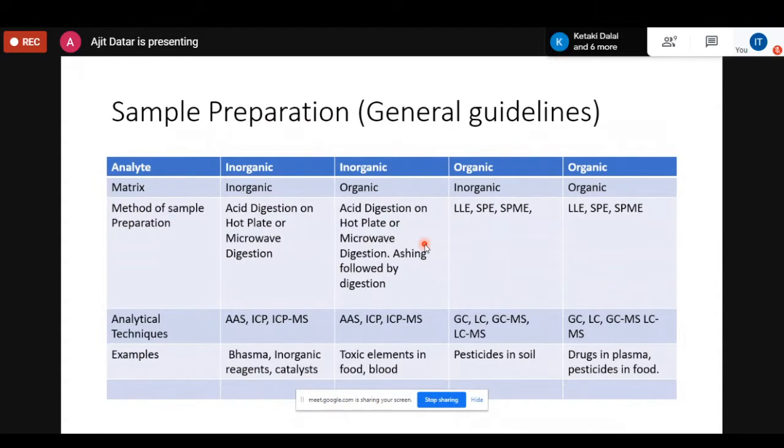Okay, so there is a microwave oven like what we have in a domestic microwave oven, but more specific for laboratory purposes, in which we can do acid digestion. It could be closed vessel or open vessel digestion. Generally, we prefer closed vessel digestion because many times we could have volatile elements like arsenic, mercury. These elements being volatile, if we do it in an open vessel, the elements will vaporize, and if we want to measure them, we have to have a closed vessel digestion.